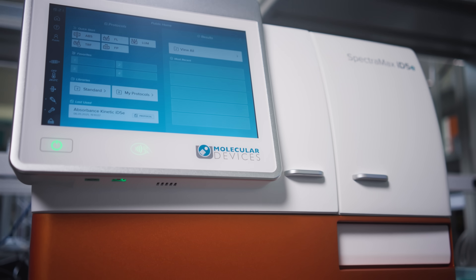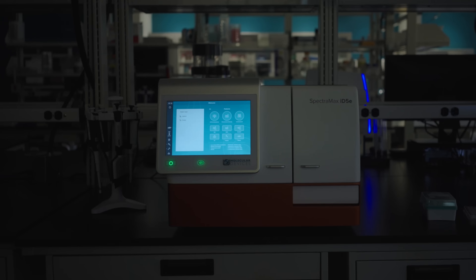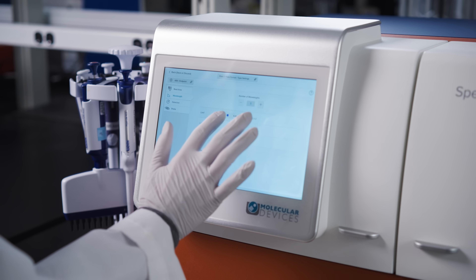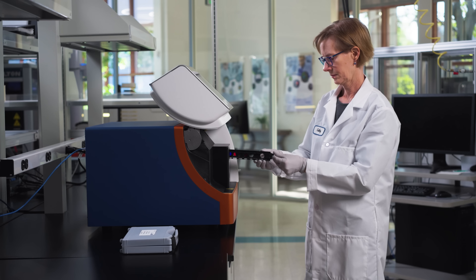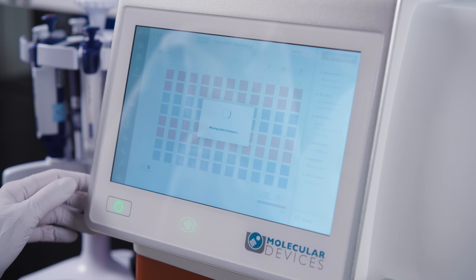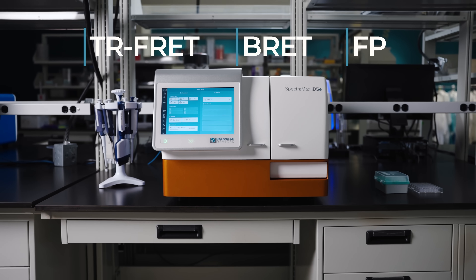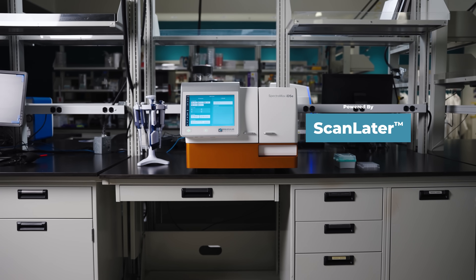Need more modes, more sensitivity, and more control? Step up to the SpectraMax ID5E Reader, our enhanced five-mode system with hybrid optics and a touchscreen interface for seamless workflows. With tunable monochromator and filter-based optics, the ID5E delivers unmatched flexibility for advanced applications including TR-FRET, FRET, FP, and even optional Western blot detection, powered by ScanLator technology.